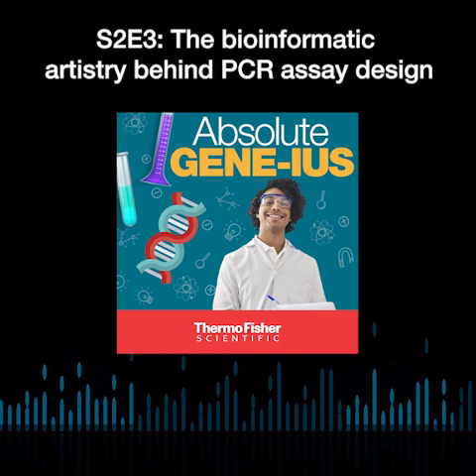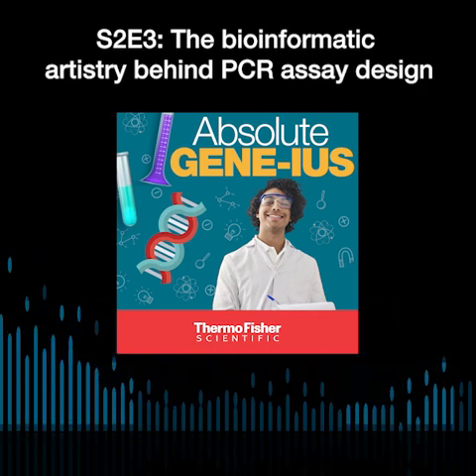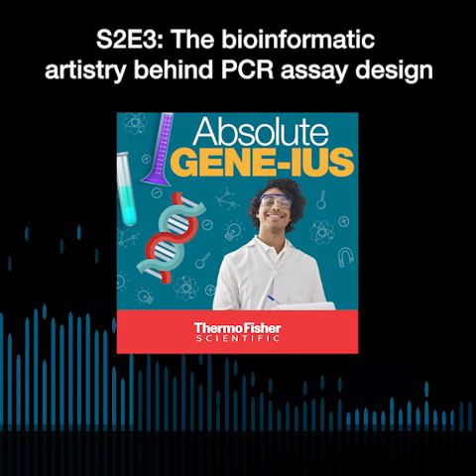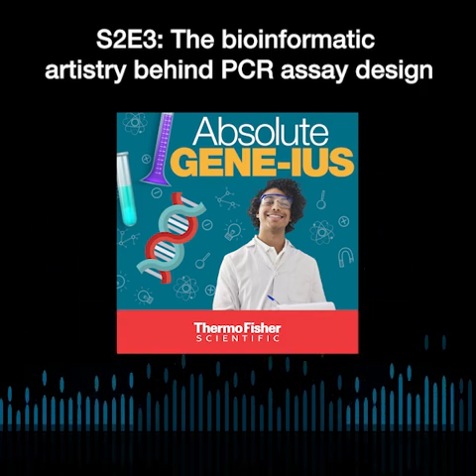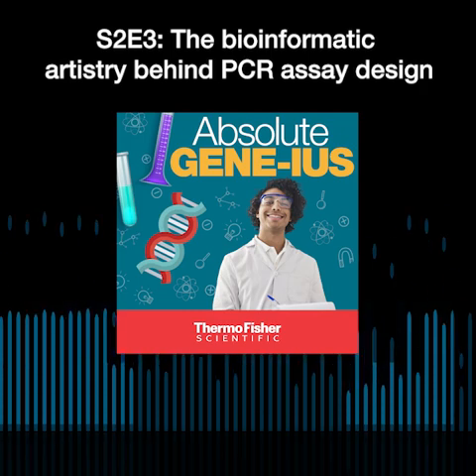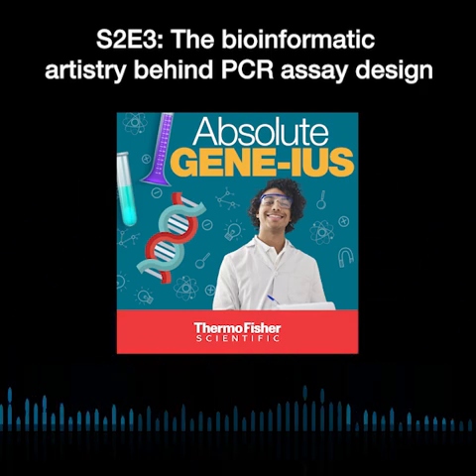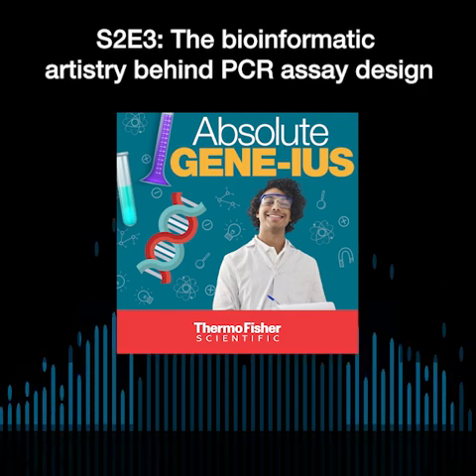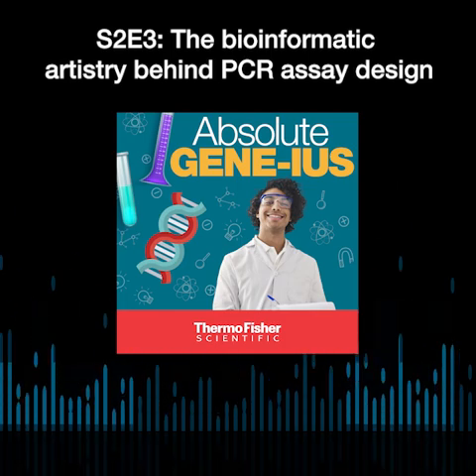Yeah. What databases do you use? Are they public databases? And can you talk a little bit about how these evolve and how gene assignments or sequences are updated regularly? The databases I like to use are NCBI, the UCSC Genome Browser, Ensembl, and then also we do use the COSMIC database, which is, I think, cancer mutation related.